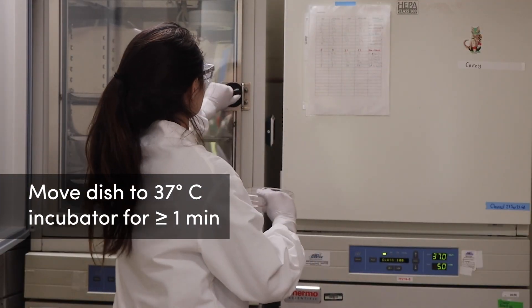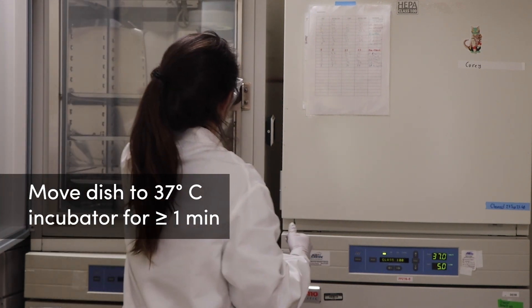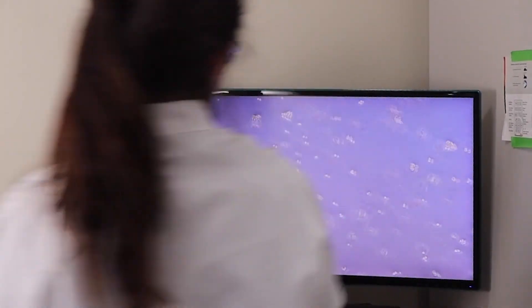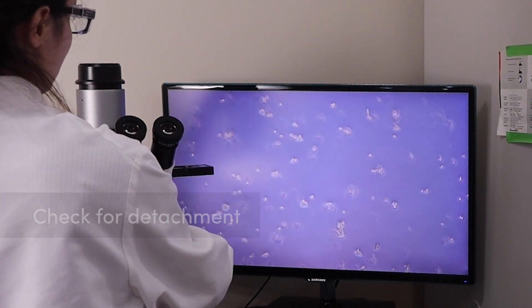Place the dish with the trypsin in the incubator at 37 degrees. The time required to detach cells from the surface can vary from about one minute to a few minutes depending on the cell line. Using the microscope, check if the cells are lifting off the surface. If not, you may return them to the incubator for a brief time before checking again. In general, we do not use mechanical agitation such as pipetting the trypsin or tapping or shaking the flask or dish.